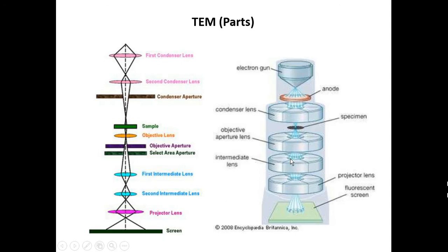But it is there. Okay, in order to direct this beam exactly over that particular area of the fluorescent screen, so that that particular area of the image of the sample is directed through this aperture and then projector lens. Then it is coming to the projector lens. Intermediate lens is here. This is the first intermediate lens that will be enlarged to a certain extent.